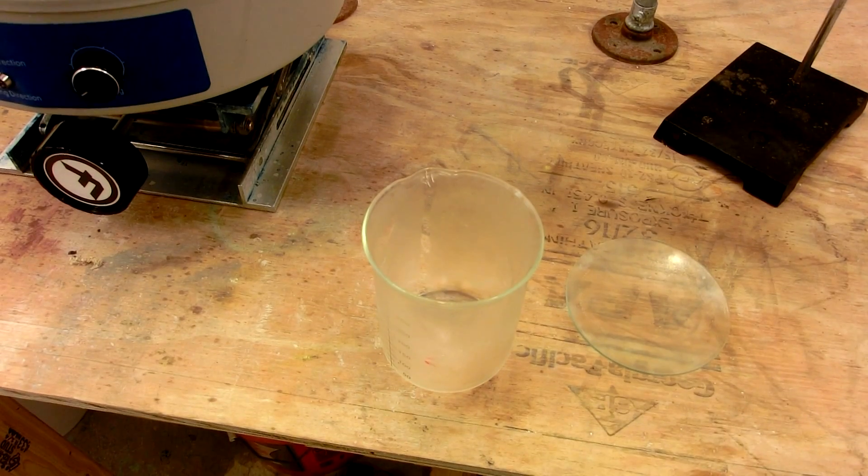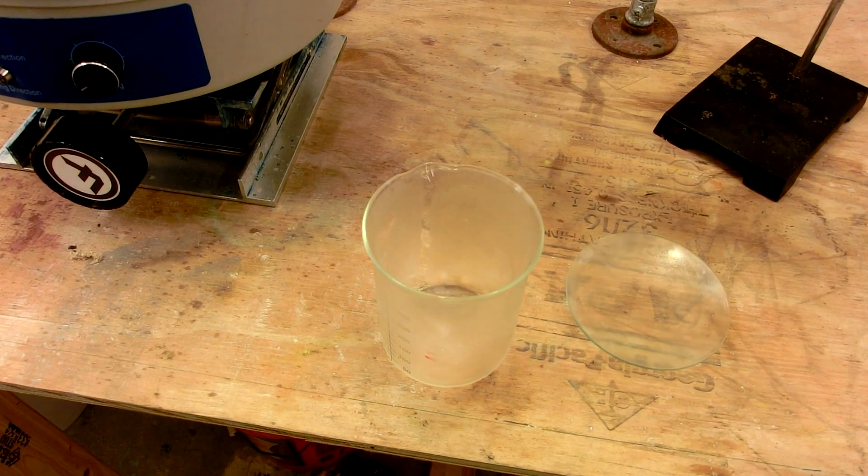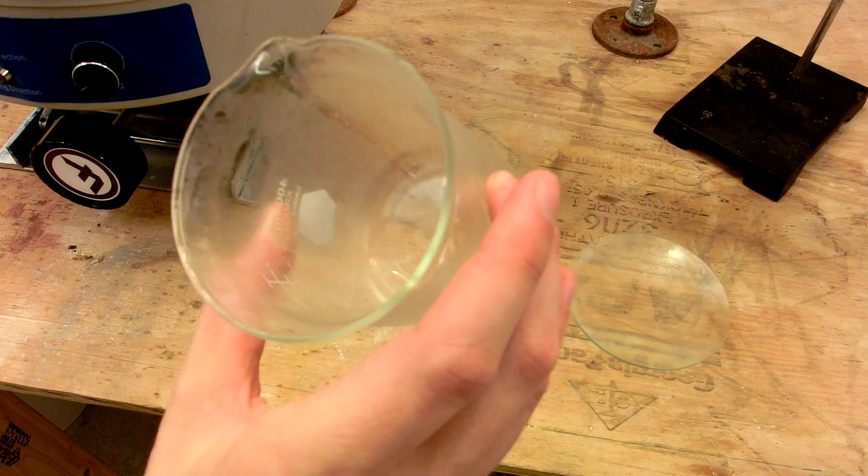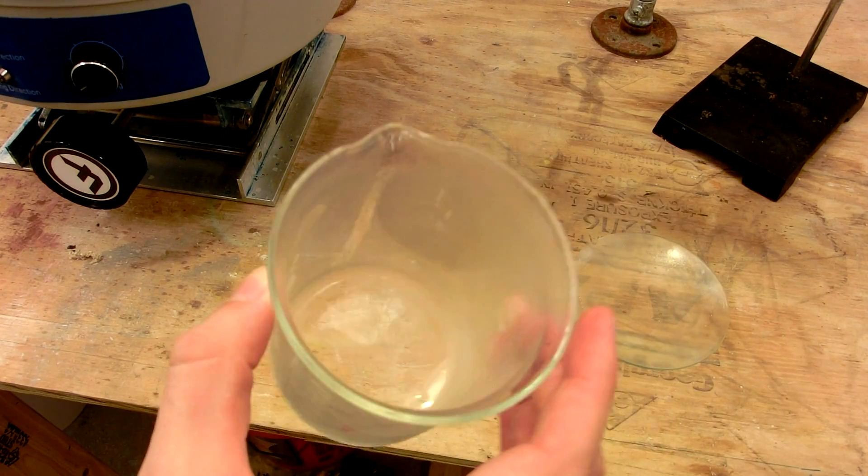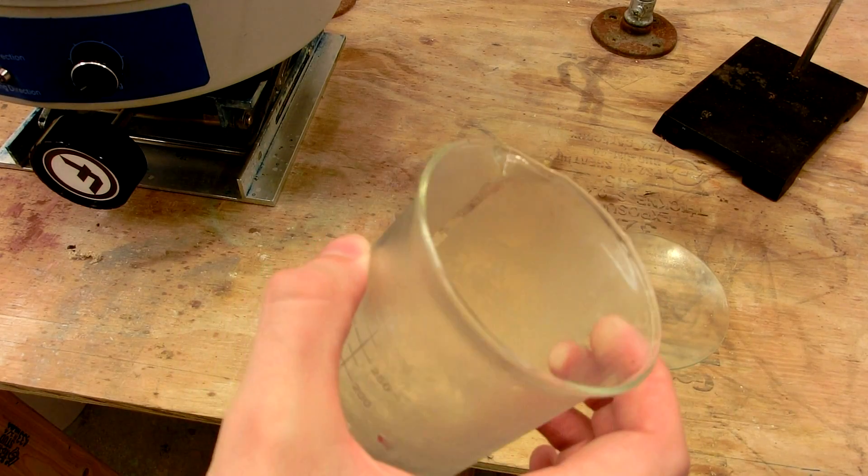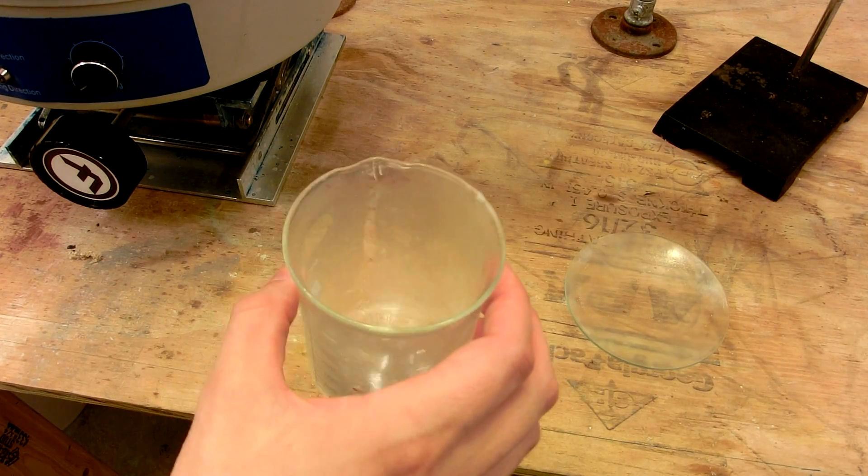While we're waiting, it's always good lab practice to begin cleaning some of your apparatus up. Notice this cold beaker here used to contain sulfuric acid. It doesn't really look like anything, so I could easily grab it later not knowing and get some sulfuric acid on my hand, which is dangerous. So always make sure you clean up after yourself.